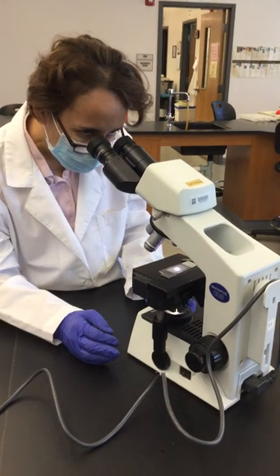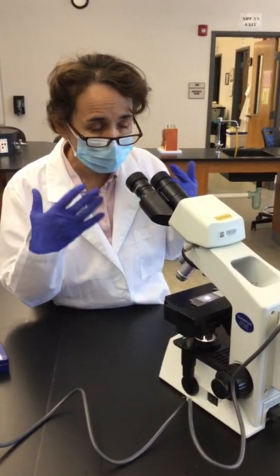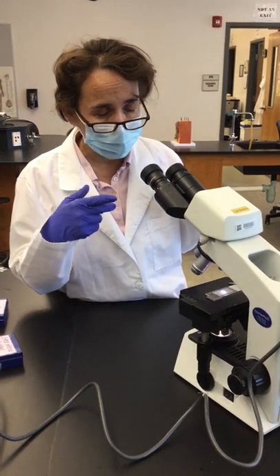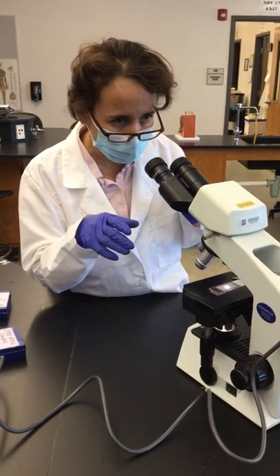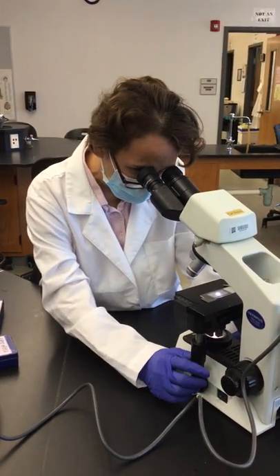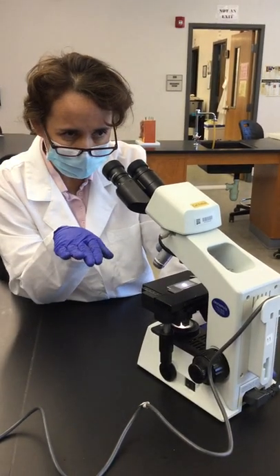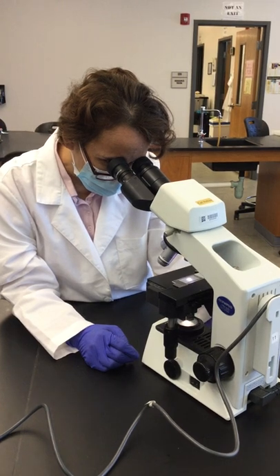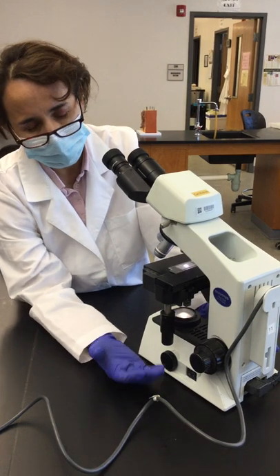Once the slide is positioned, look through the ocular lens. It takes time to get used to looking through it. You can look with both eyes open or just one. One thing to keep in mind — if you get too close, you may start looking at your own eyelashes. Then use the coarse knob to bring the stage up to the level where you can see the letter E. You don't have to see it perfectly focused, just get it in view.